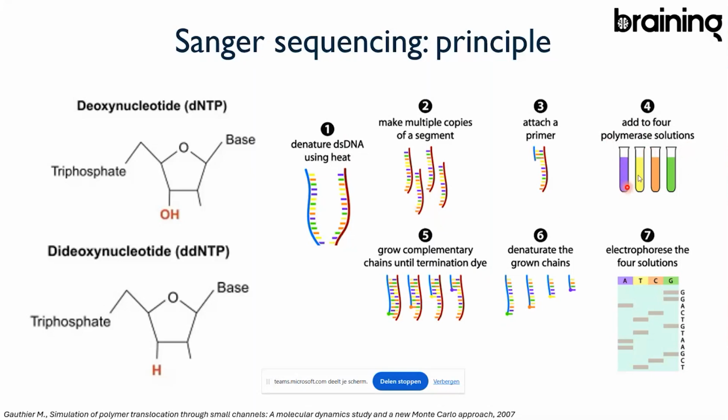So if you use this mixture with deoxynucleotides and dideoxynucleotides, you will get a random incorporation of these dideoxynucleotides and a random termination of your polymerase chain reaction. And so you will have a mix of very different fragments, which you can separate by electrophoresis. And basically then, based on the size that you have, you read out your sequence. In principle, it's very simple, but you can also understand that you can do this for, let's say, one strand of double-stranded DNA, one small segment, right?